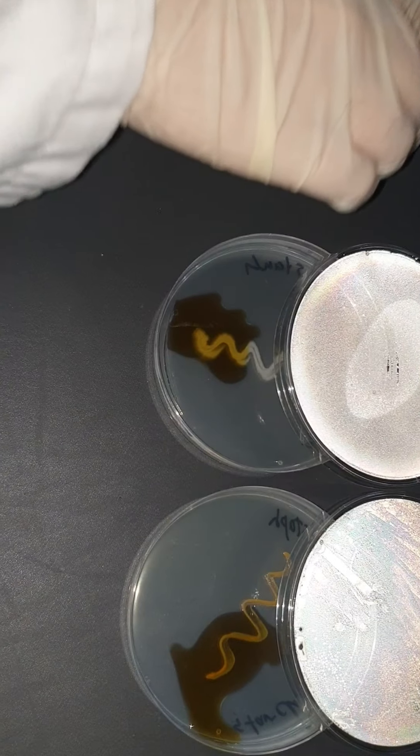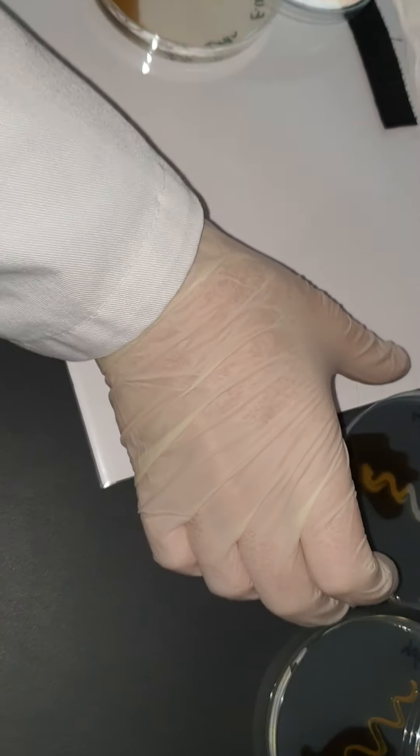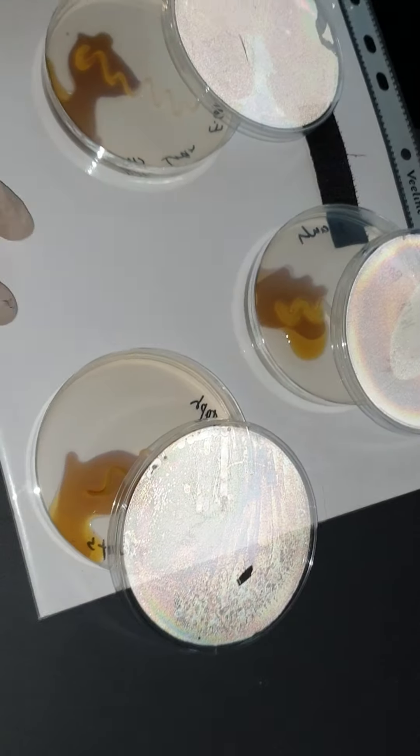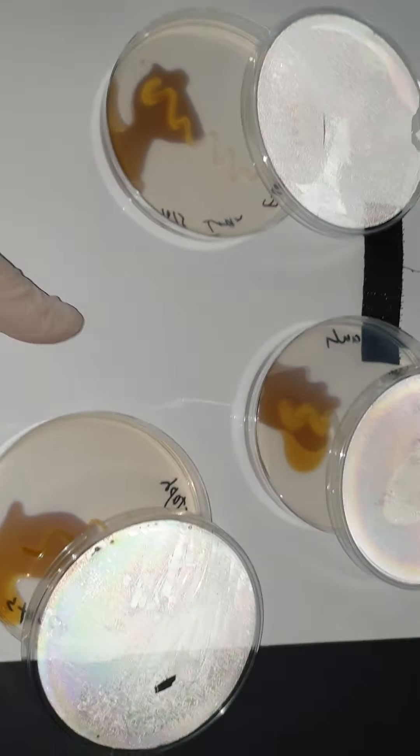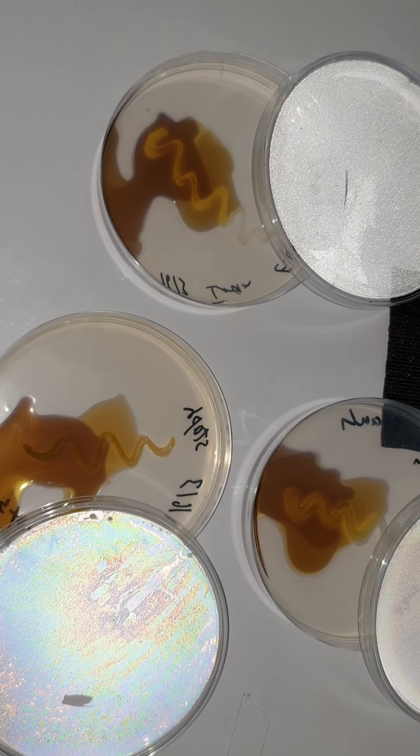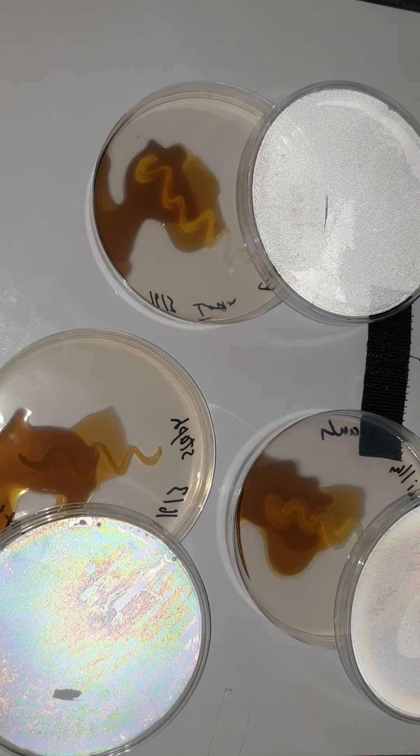I need a white background to be able to judge the results. A little bit more iodine. Dark blue color with iodine indicates the presence of starch, which means starch was not digested. A yellow color around the colony indicates that the bacteria was capable of digesting the starch. Let's focus on the petri dishes one by one.